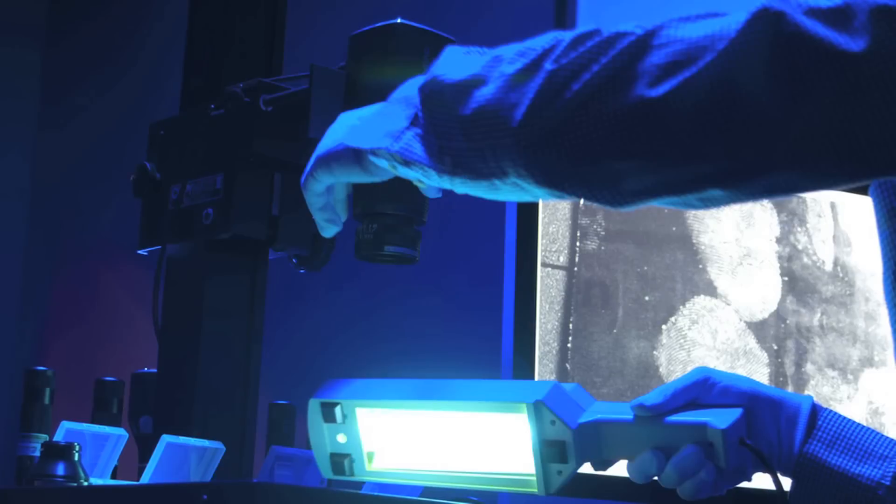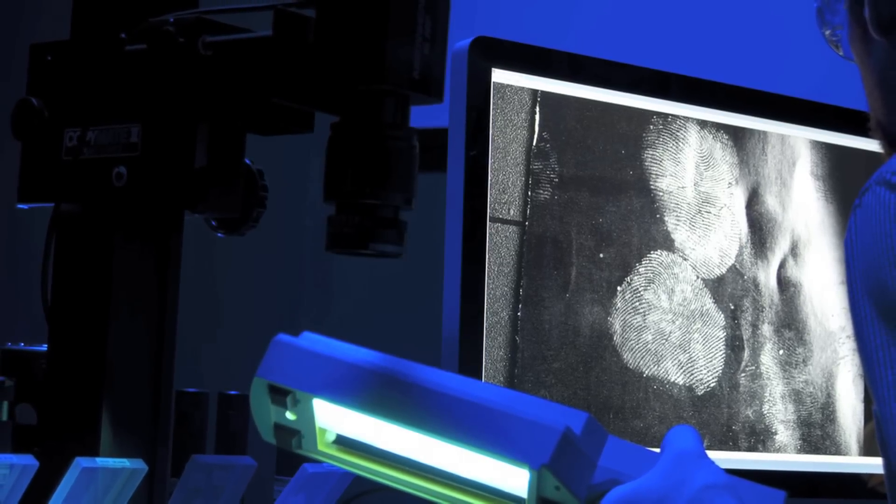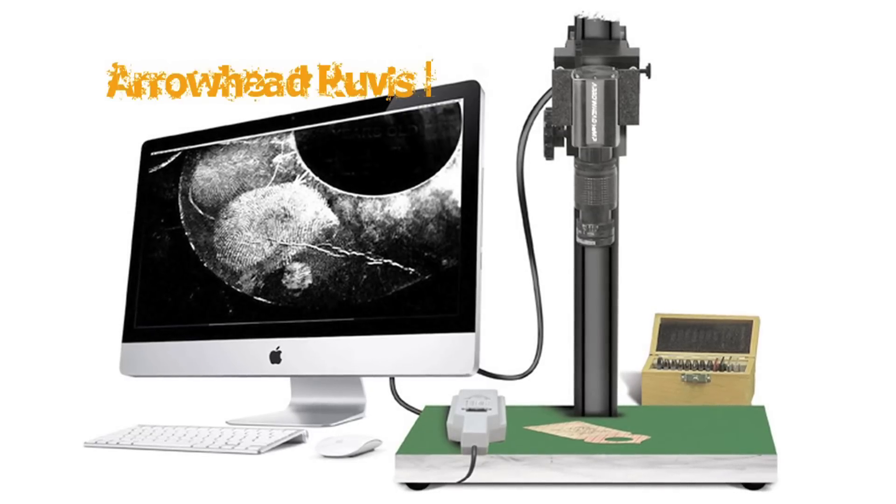Digitally enhance latent fingerprints with the most powerful latent fingerprint enhancement software on the market. Significantly reduce the time required to lift, photograph, and print latent fingerprints to scale. And now, the complete system in action.